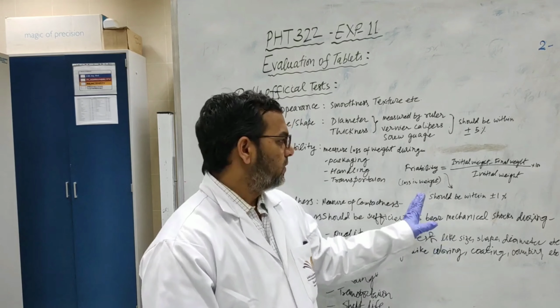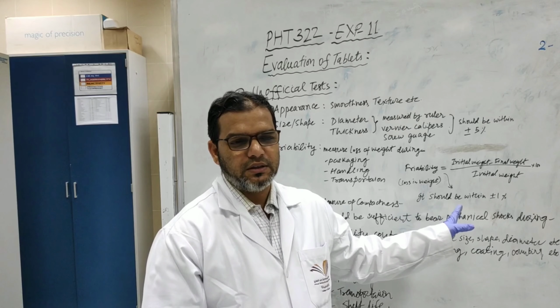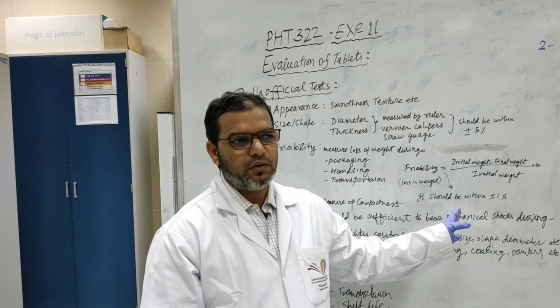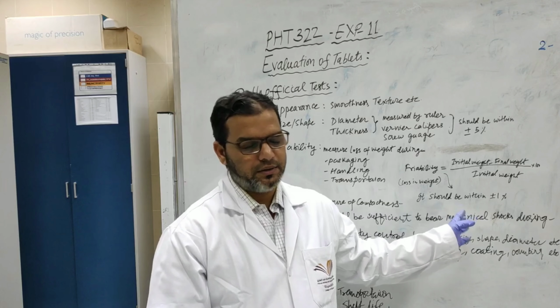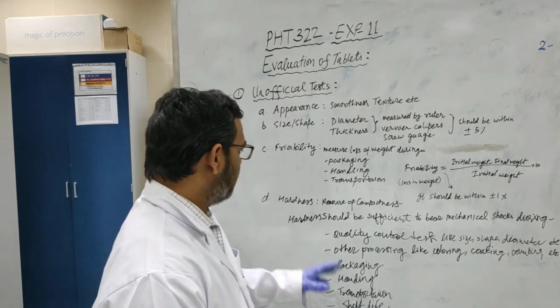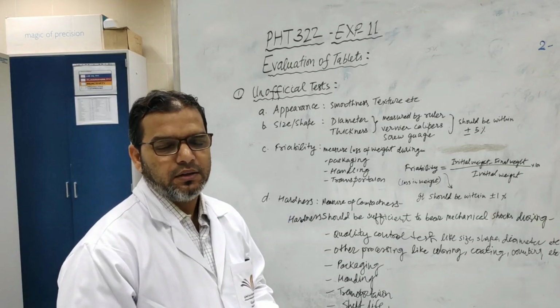Okay, so I will do this experiment for you. You will see the video of this experiment, how to do the friability testing of the tablet. Okay, then we have the hardness measurement.